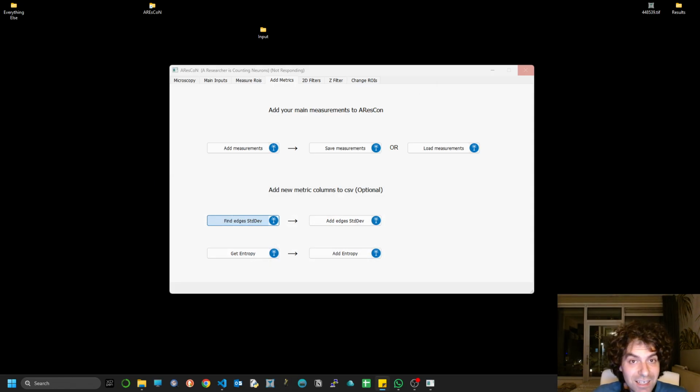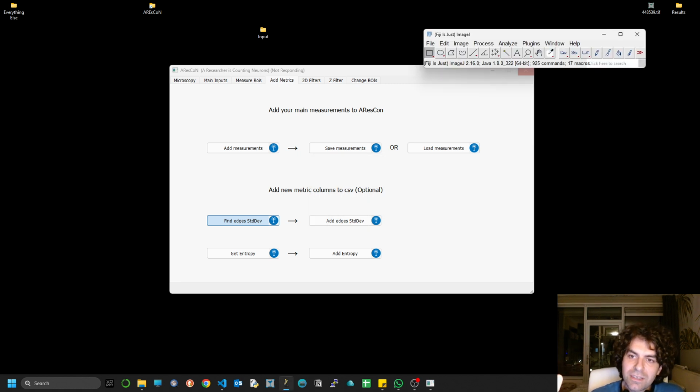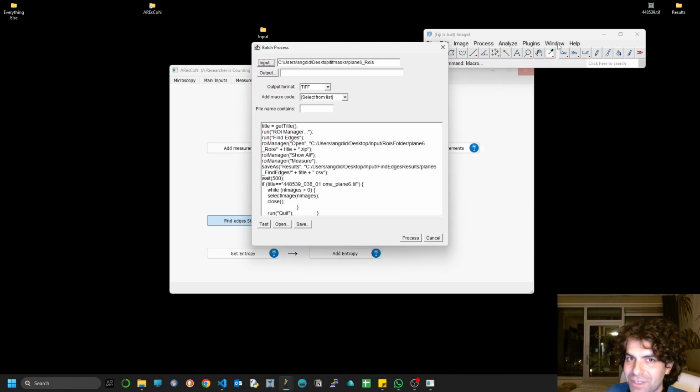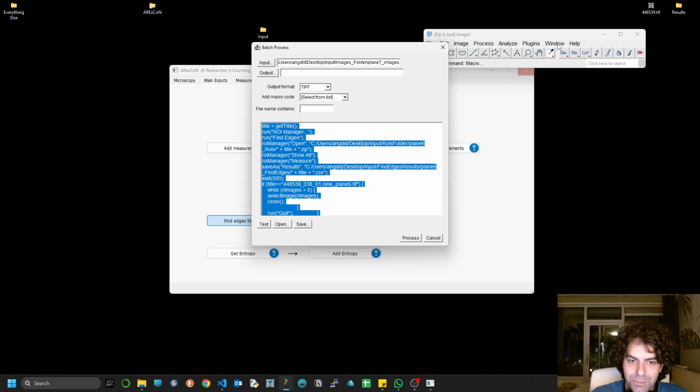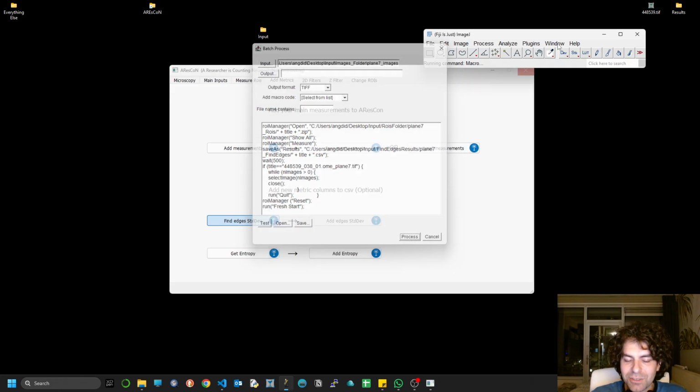I hope it will work in your case because it's been tested thoroughly, so that it runs without problems. However, if it doesn't, for whatever reason, you might need to interrupt. Imagine that for whatever reason it cannot activate your Fiji panel that you see right there. The rest of the steps that are going to be performed are still running. As you can see now, tab is pressed, Control A is pressed, delete is pressed, Control V is pressed, and so on.